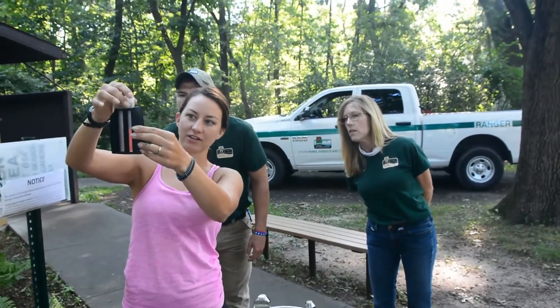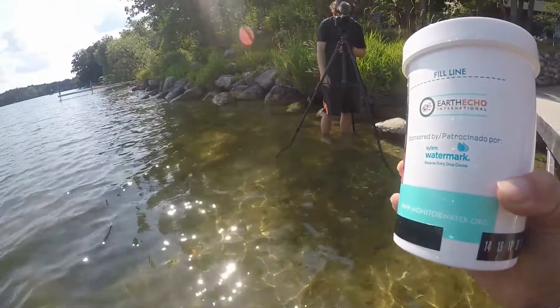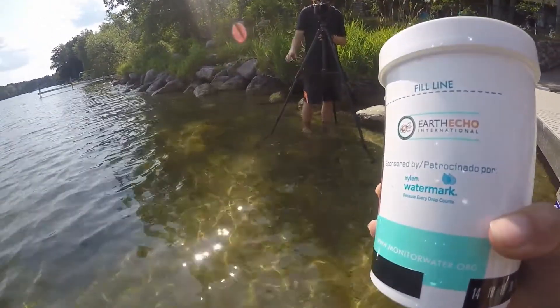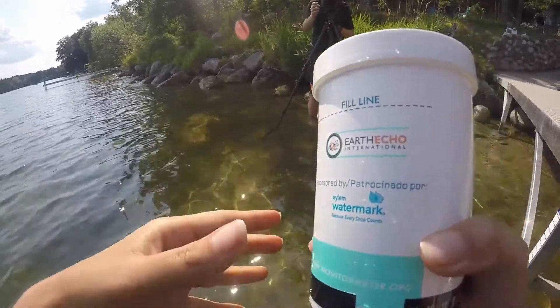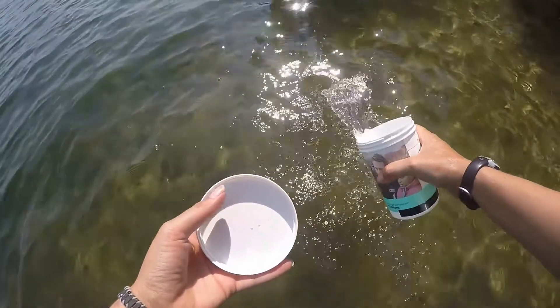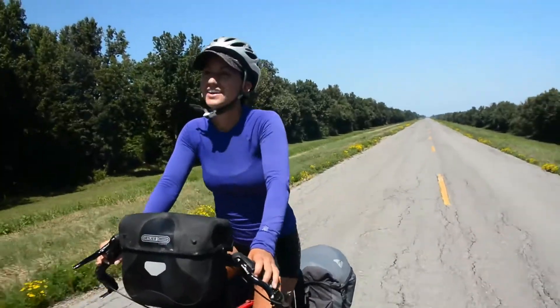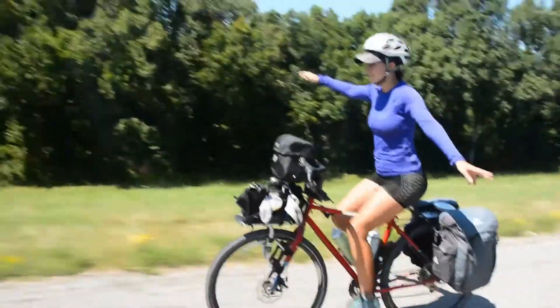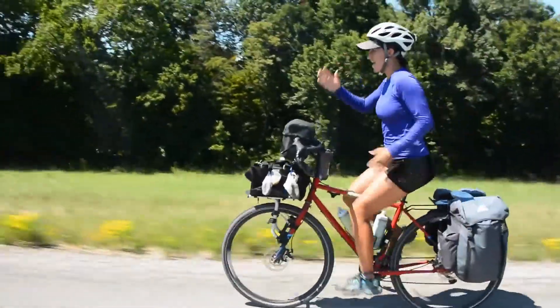The kits we're going to be using to test this water are primarily from Earth Echo International, which is a non-profit. They have a water challenge to get as many people around the world testing their water quality. They primarily market it to students, but it's great for our bike touring because it's a compact little kit and it measures a variety of things.